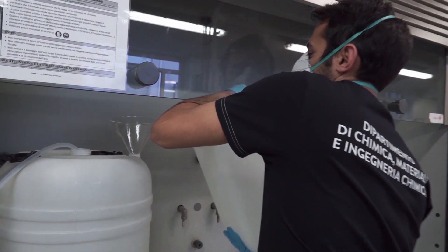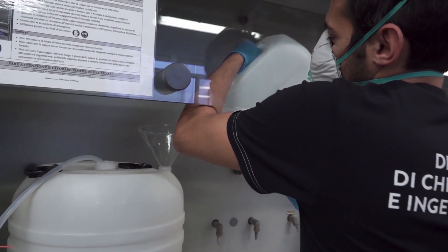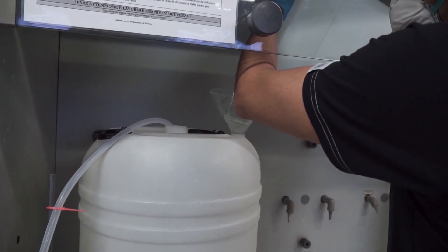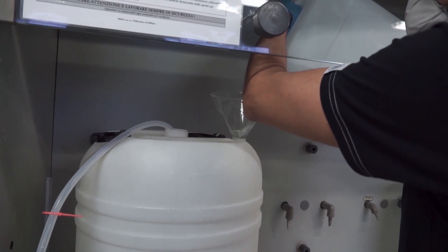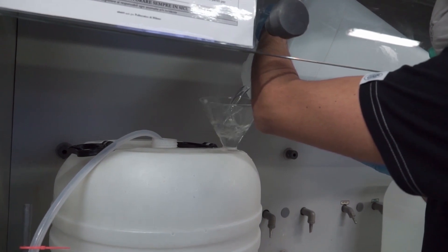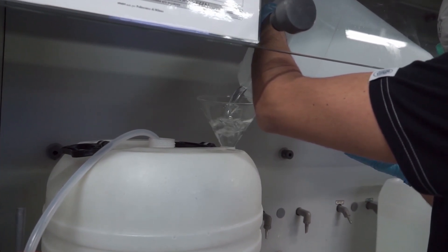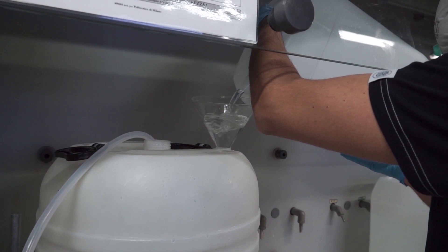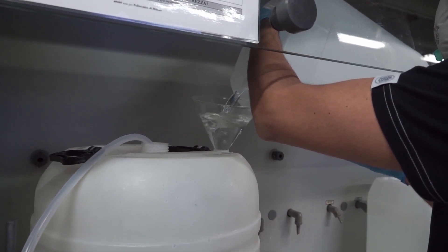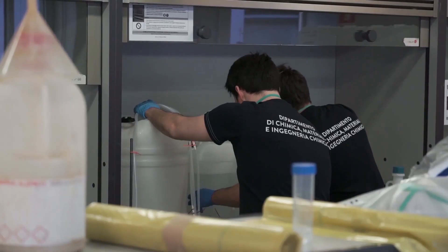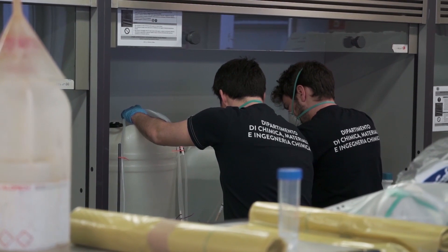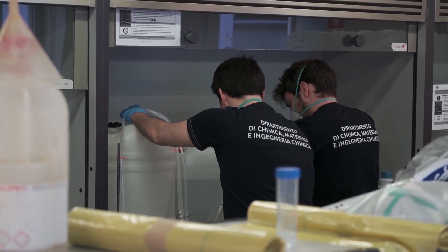Regarding the aqueous solution, if a pump is available to pump the glycerol, the process can be carried out adding a specific pump for it. The flow rates and concentrations required in this new configuration can be found in the attached document. Due to the higher cost of pumps for viscous liquids like glycerol, we have only considered the use of two pumps. Specifically, it is recommended to prepare in advance the total volume required and then proceed with filling the tank for the aqueous solution containing glycerol and hydrogen peroxide.